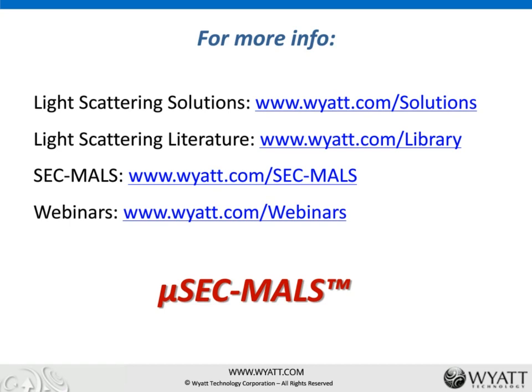Okay. And another question here. Could you please elaborate on the calculation of the extinction coefficient from RI determined concentration? Okay. So because we have both concentration detectors online and their concentration of mass need to conserve. So if we know the concentration from one detector, then we can calculate the unknown parameter for UV, which will be the extinction coefficient from the UV detector.